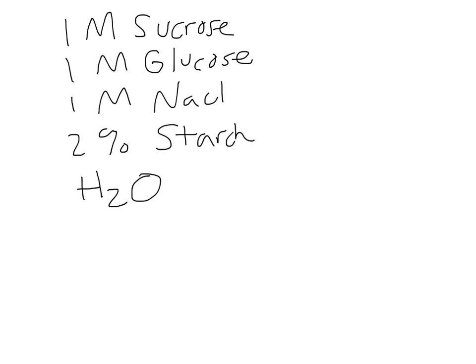And with osmosis and diffusion, there are a lot of different labs that we could do. We could look at the rate of diffusion over time. We could look at how rate is correlated with the amount of the solution. What we're basically looking at for this lab is a correlation between permeability and molecular weight, so molecule size.